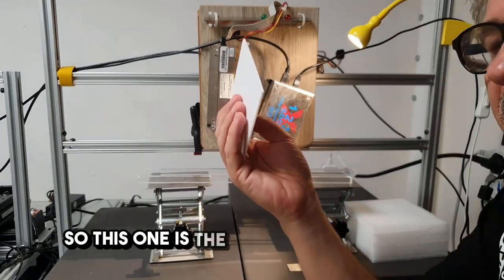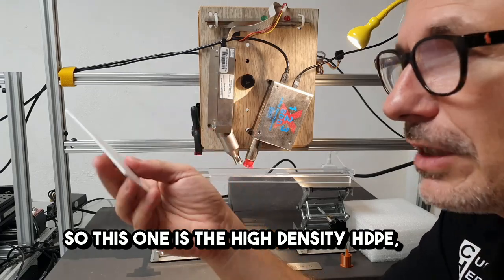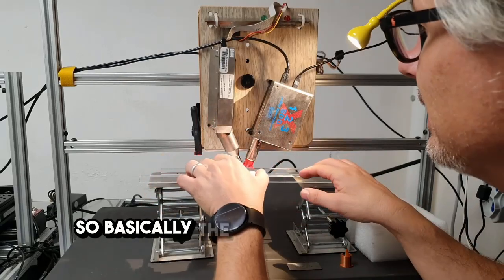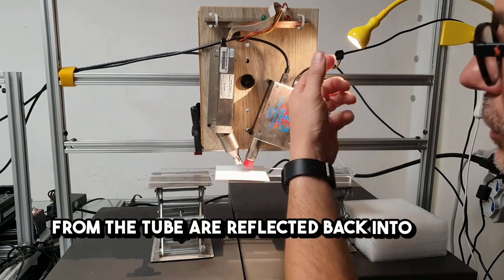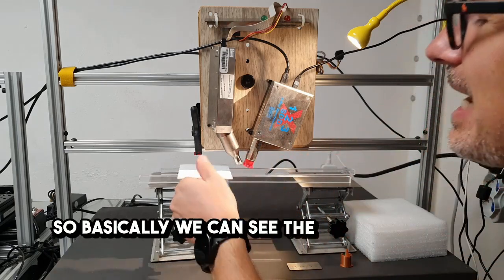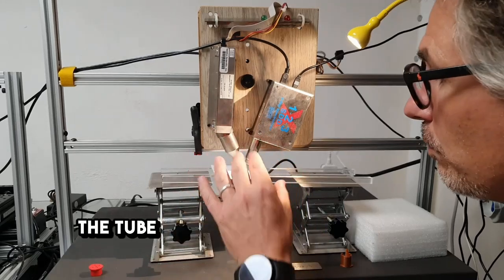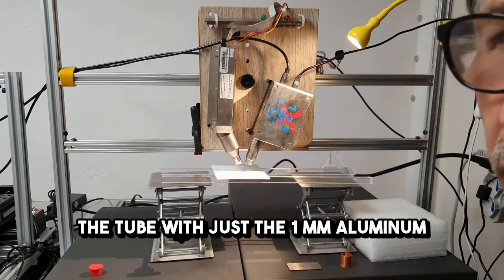So this one is the high density PE, polyethylene filter, plastic. This one acts as a mirror for the X-ray. So basically the idea is that the X-rays coming from the tube are reflected back into this spectrometer. So basically we can see the output of the tube. And we are ready to measure the spectrum of the tube with just the 1 millimeter aluminum filter.